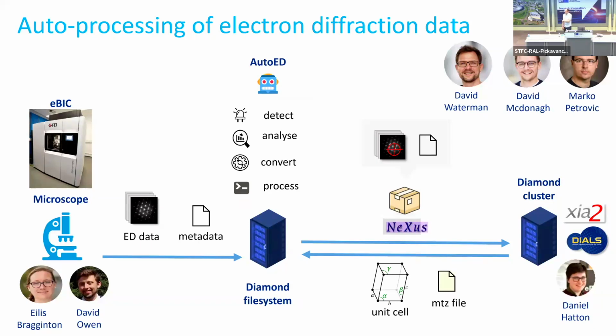So this has been done as a kind of step on the way to automation. Previously, automation efforts have failed because of incomplete metadata or poor management of data. This project has specifically addressed that, so that we can now do automated processing at EBIC. And that was done quite quickly. I think that took about 6 months to get all of that sorted out.